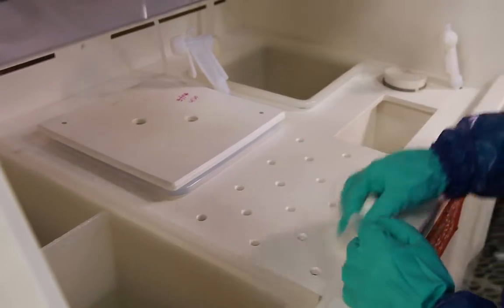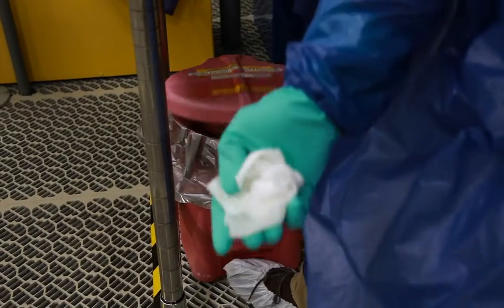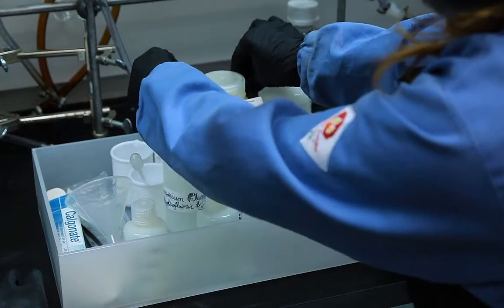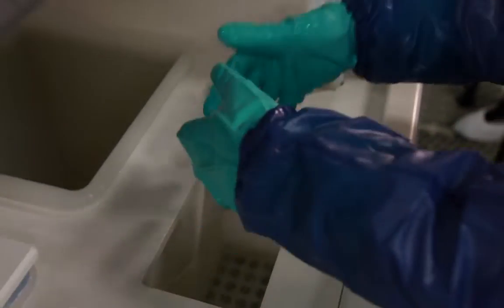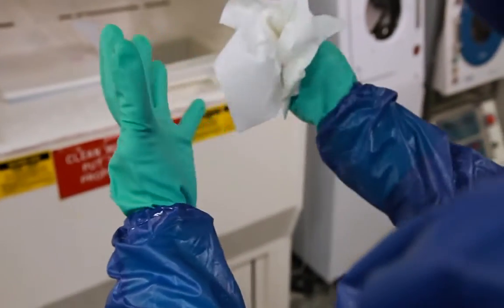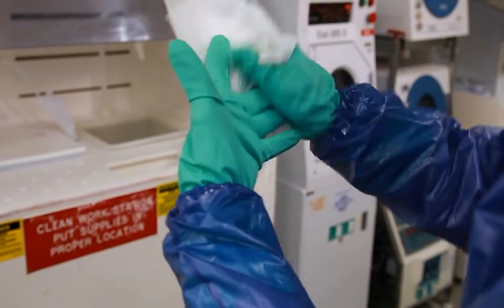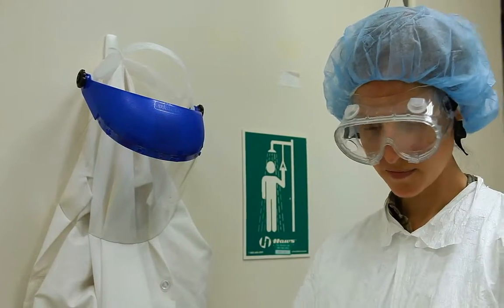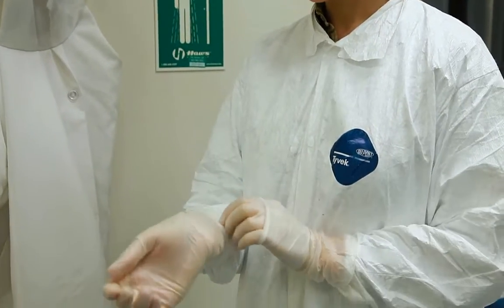Wipe up all spills immediately and discard all contaminated cleanup materials safely in the appropriate waste container. HF contaminant waste must never be discarded with regular trash. Use automated glove rinsing if available in the work area, and make sure to carefully dry your gloves before removing them. Otherwise, follow your lab specific procedure for glove rinsing, drying and removal. Carefully remove your PPE and discard and or store per your lab specific procedure.